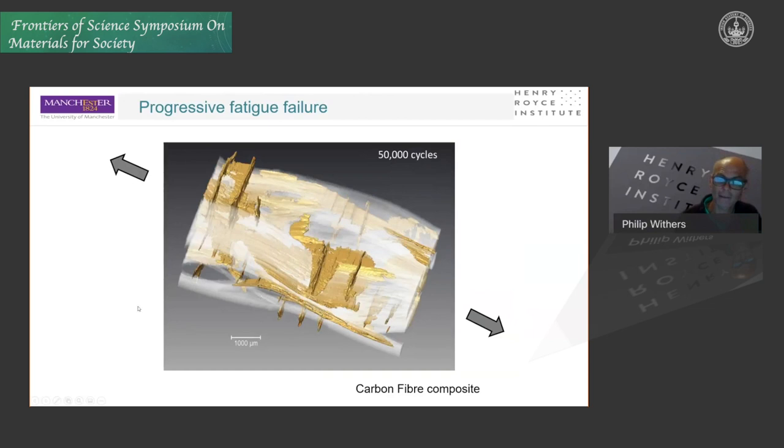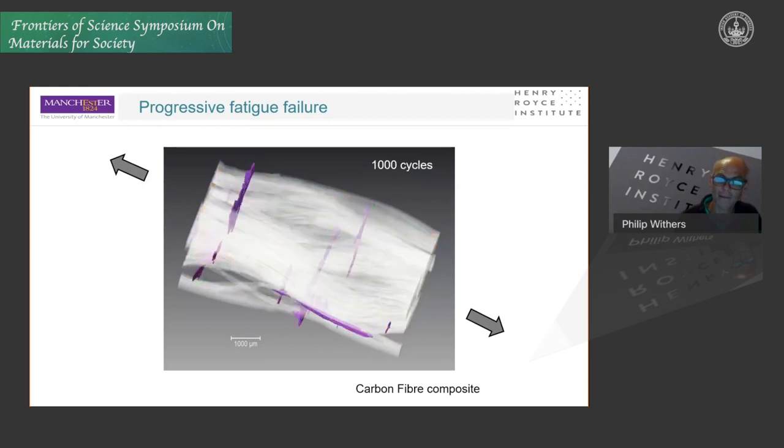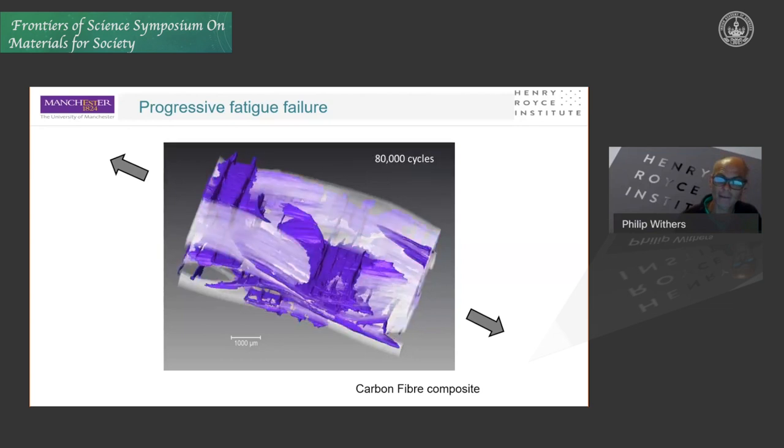And what we can see is, over many cycles, we can follow this sample and see that the cracking intensifies, such that by the time we get to about 70,000 cycles, we now have extensive cracking. And of course, this is at 80,000 just before failure, and we can see a comprehensive array of cracks and delaminations, which are constrained within the weave of the composite, but which ultimately give rise to failure at about 85,000 cycles. But the point is, the first defects formed at just 1,000 cycles, and yet we end up with a life of about 80 to 85,000 cycles. And so it's important that we understand the nature of these defects and learn how to live with them. Otherwise, we would have to unrealistically cut short the life of the component.